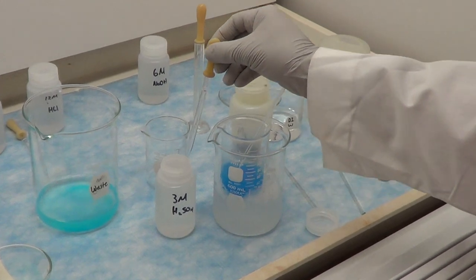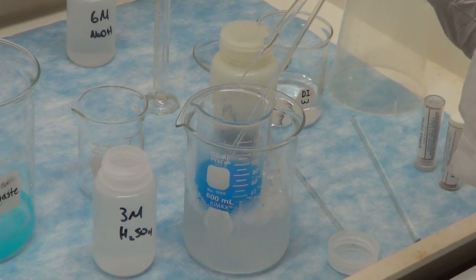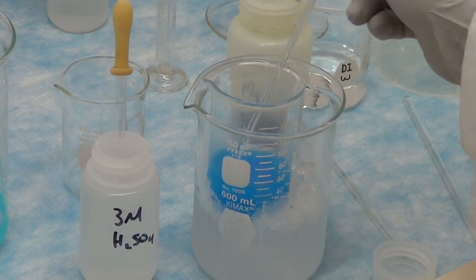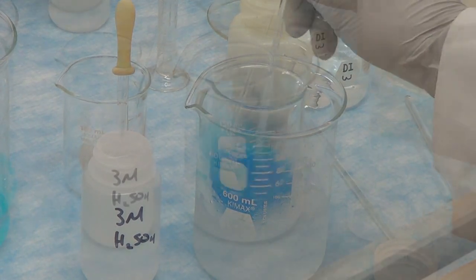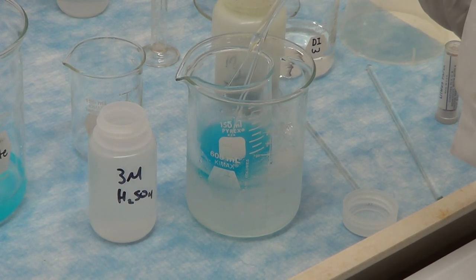We will then add three molar sulfuric acid dropwise with stirring to dissolve the precipitate. This is an acid base reaction where acid and base react to form salt and water. Here copper hydroxide reacts with sulfuric acid to form copper sulfate and water.